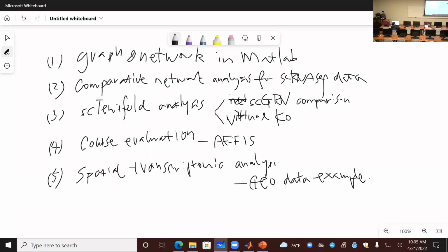So with a real dataset, we will see how we can download a dataset from the GEO database, including the image. Then we do alignment between your measured spots of expression and the image of the section, and then do the spatial analysis for this.